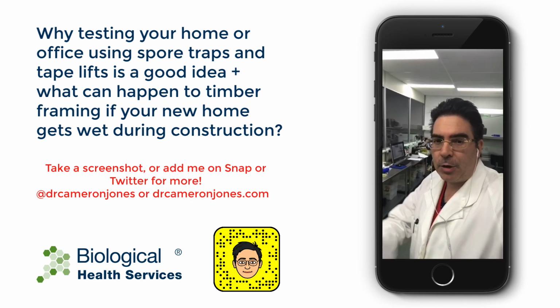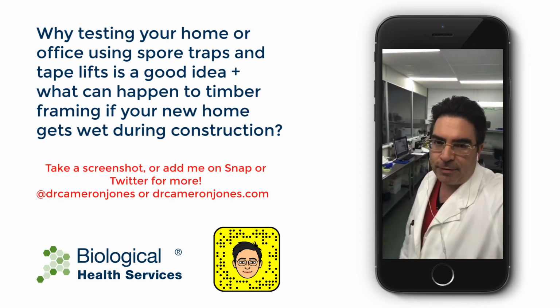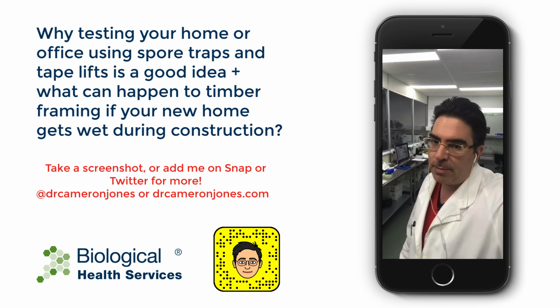Before I finish up today, I want to show you how I use these things called tape lifts to actually sample from surfaces that are suspected of having mould on it.